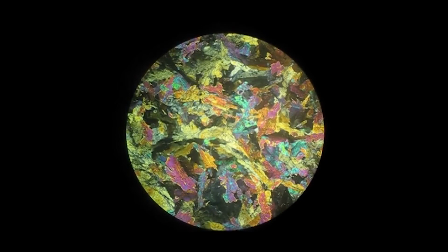The working distance. The working distance of an objective is the distance between its front lens and the top of the cover glass of the microslide when the object is in focus. For low power or medium power objectives, it may be several centimeters, but for high power objectives, it is a fraction of a millimeter. Hence, great care should be taken while focusing under high power objectives, since over focusing results in the breaking of the cover glass of the microslide or in scratching the lens of the objective.